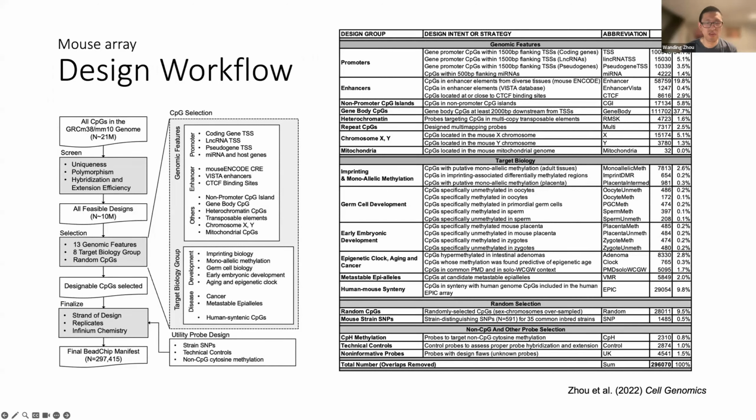A lot of the focus is going to be on cell type deconvolution and using the arrays to track cell identities. If we have an opportunity, we would love to receive feedback or collaborate on the future development of the Infinium bead arrays, particularly with labs that have, for example, independent sequencing technology development backgrounds.